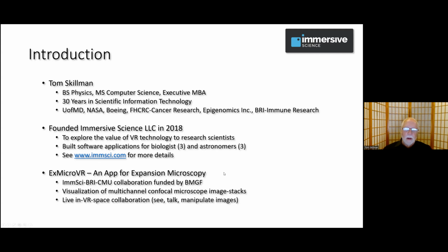It's a collaboration that was funded by the Bill and Melinda Gates Foundation between my company, Benaroya Research Institute, and Carnegie Mellon, where Leon is. It was really focused on a subdomain of expansion microscopy, looking at host-pathogen interaction and the details of how you stain and expand more complex biological samples. Is that close enough, Leon? Yes. Okay.